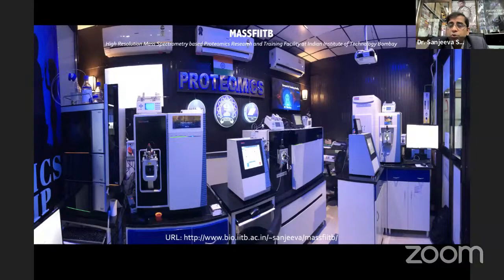And what we thought, we are going to show you some of these instruments, how they can be utilized for different type of workflows. So for example, here you see Orbitrap Fusion, which is really utilized for the deep proteome type of analysis or deep phosphoproteome analysis. Q-Exactive along with the HPLC configuration is heavily utilized for metabolomics, and triple quadrupole instrument is used for the targeted proteomics or metabolomics based analysis. So we will take more time in the lab and try to walk you through these type of workflows.